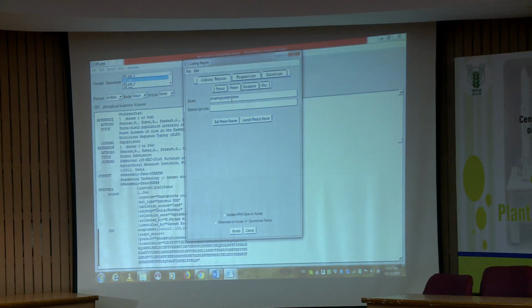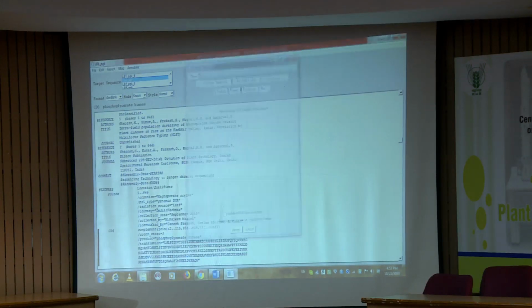The same thing: if we need any information, we just go to NCBI, search everything, and we get all the information. That is because the author, the person who did that work, entered all the information. The more you enter, the more transparent information will be available for the second researcher, right? So all these options you can highlight and keep on adding, right?